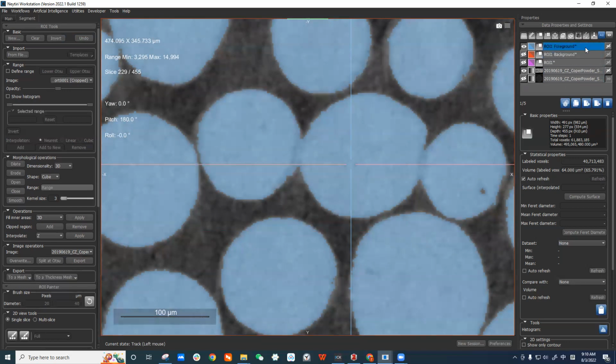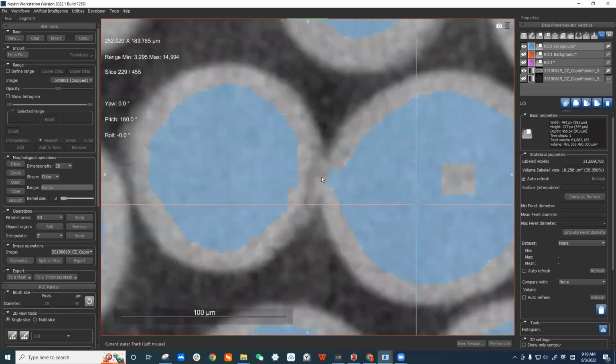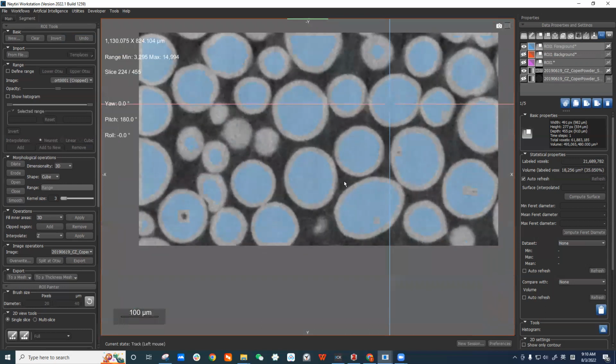I erode this ROI. This is easier to understand. So I erode this ROI to make it smaller. You see it's getting smaller now. If I erode it multiple times, it will separate many particles. The touching edge, the touching surface will be broken. It's not as good as distance map, but it serves my purpose today, which is a workflow.